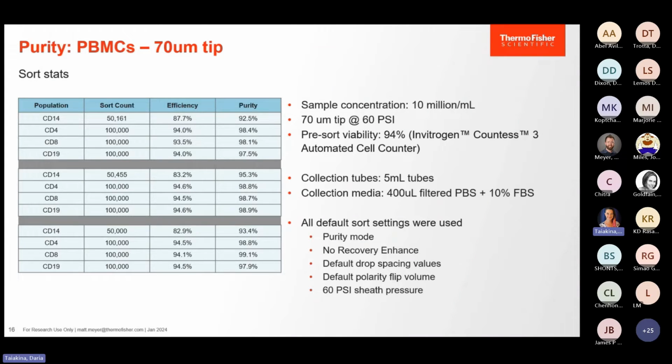In this case, we do have a mode that is recovery enhanced mode. In this experiment, we did not use it because we were more focused on purity, but that can also be used to increase recovery.